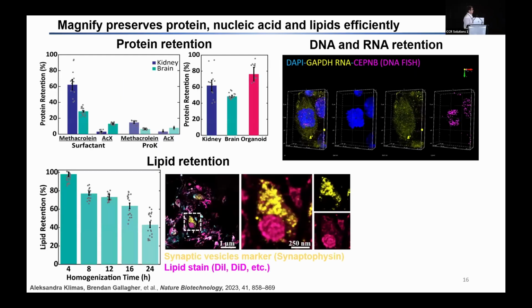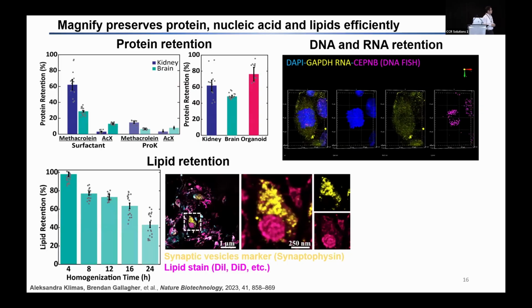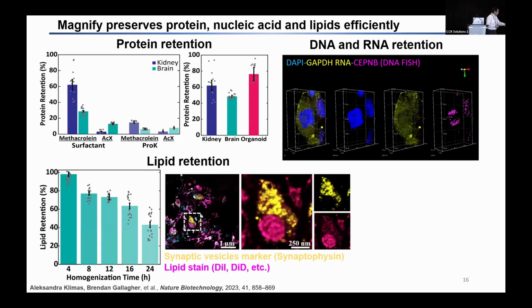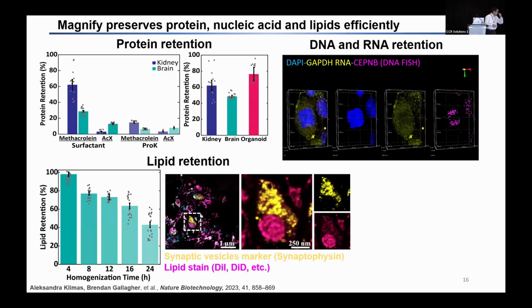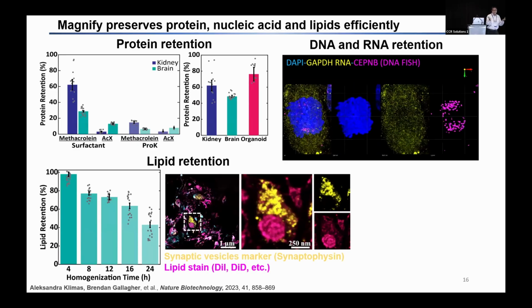Magnify has a universal anchoring approach. So basically, it anchors all kinds of different biomolecules, for example, proteins, DNA, RNA, and lipids. The lipid one is quite interesting. So this one is surprising, right? Because we use the surfactant, right?